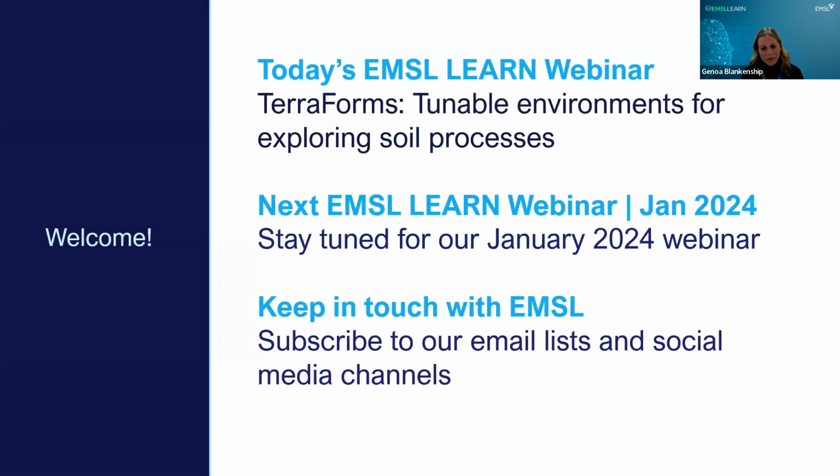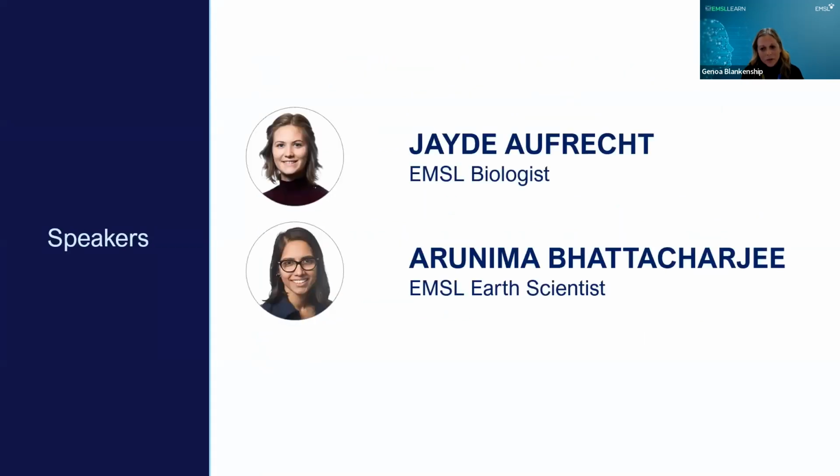But today we are here to talk about TerraForms. We have two presenters for you, Arunima Bhattacharjee and Jayde Aufrecht, who will be introducing a new capability that is available here at EMSL that they developed called TerraForms, Tunable Environments for Exploring Soil Processes. Jayde will begin this webinar by presenting two technologies for zooming into carbon cycling hotspots underground, namely synthetic soil aggregates and rhizochips. Then Arunima will be discussing how you can use pore-scale micromodels, minerals, rhizochips, and SubTap microbial and rhizosphere platforms to look at the influence of carbon distribution on microbe and plant development.